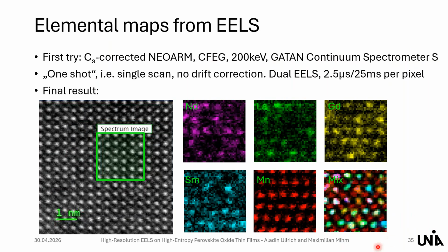To make this overlay, I must say I applied some filters. I did a little bit of sharpening and increasing the contrast to get this nice overlay. But all the other data here are raw data, just colored to distinguish between the different elements. So now the question is, is this elemental distribution stable, or is it maybe affected by the electron beam, since we applied a quite high intensity here?